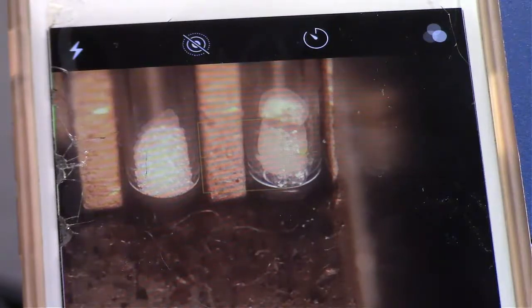I can still see some crystals at the bottom. Some of those crystals on top are basically falling down to the bottom. And it looks like the last of the crystals are melting. So all of those crystals have melted. We're at 232. And on the left, you can see those crystals starting to melt too. So I would say right when the sample on the right ended, that's when the one on the left started.